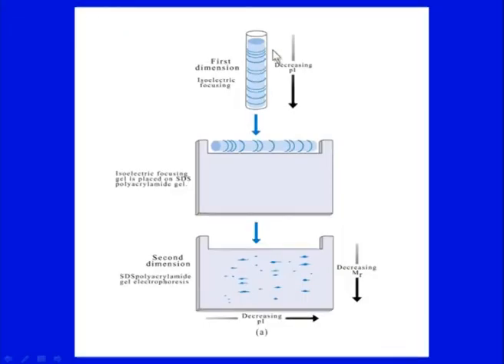Once the agarose has set, electrophoresis is started, and the SDS-bound proteins will run into the stacking gel and then separate according to size in the resolving gel. So, that is a very simple way of running a two dimensional gel. If you can see in this figure, first isoelectric focusing has been performed, and you can see various protein bands here after staining.